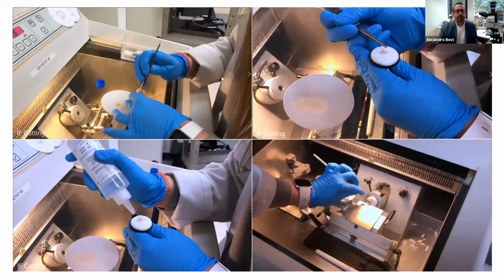In a nutshell, the tissue that comes in Michel's transport media will get washed, blotted, and then embedded. And the embedding process is not trivial. I mean, you have to really know what you're doing. You have to start with a really flat surface, and embed your tissue in a way that facilitates the read eventually when you get the slide on your microscope. So you have to be really careful with this step. Then we cover it with embedding media. This is OCT. We freeze it on the cryostat, and then we can start sectioning.